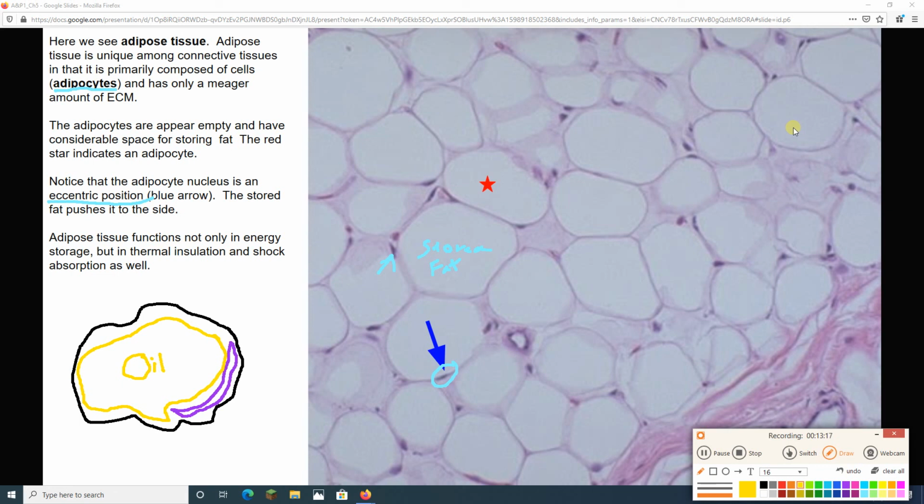All right. So this is adipose tissue, fat tissue. Obviously, if you're storing fat, you're storing energy. Fat is important to us for other reasons. We have fat around a lot of organs, kidneys, heart, eyeballs, and it provides a shock absorption function there. Plus the fat under our skin. There's fat under our dermis. Remember we saw the skin model, we saw the hypodermis, and the fat under there is for thermal insulation. Prevents heat from leaving your body.